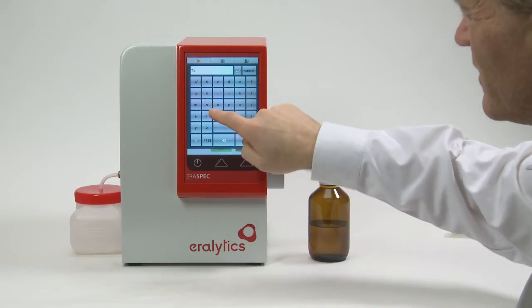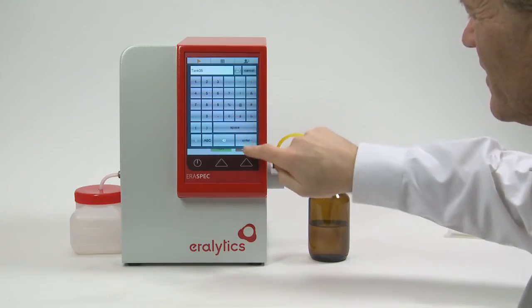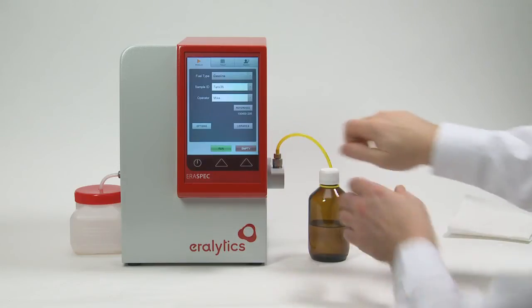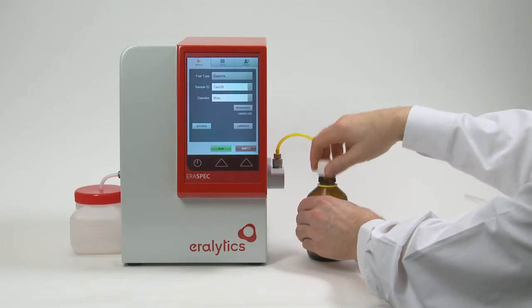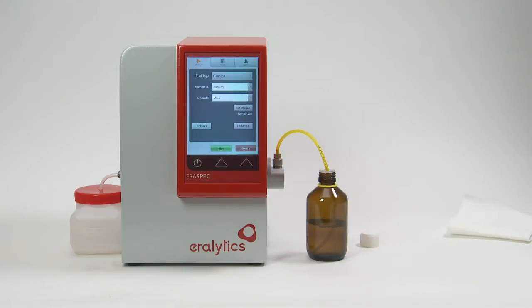Enter the sample ID and the operator on the pop-up keyboard or select them from the drop-down list of previously entered names. Then insert the filling tube into the sample container and press run.